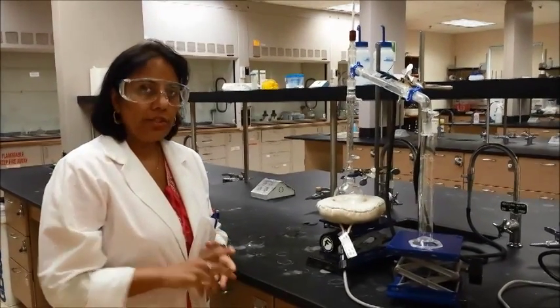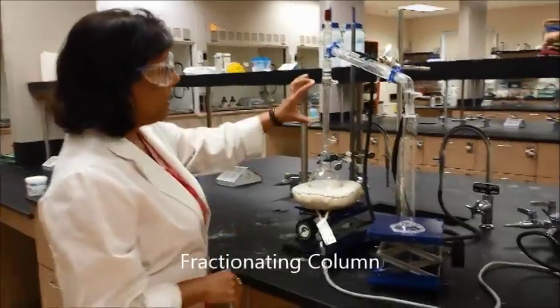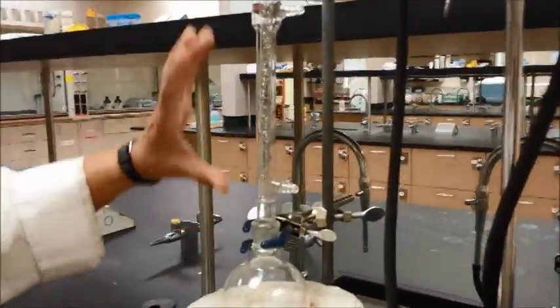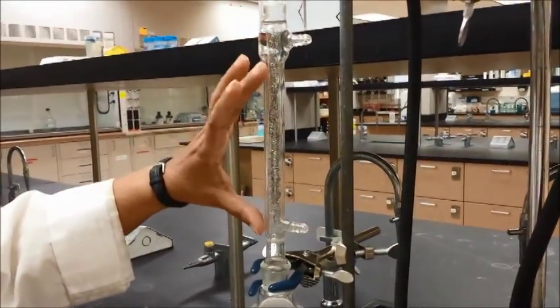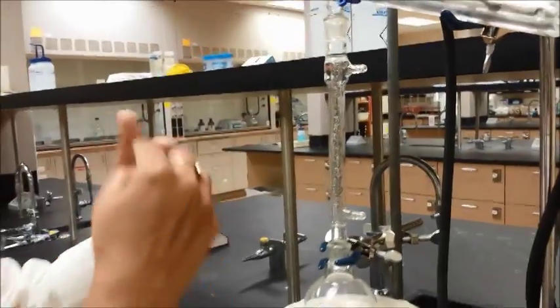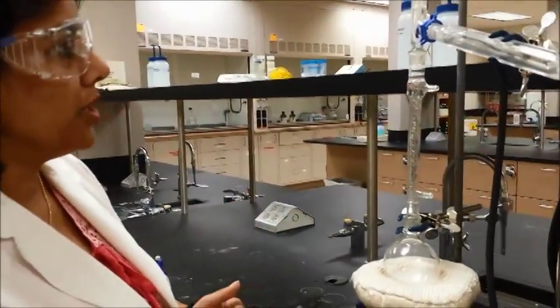To set up the fractional distillation you need to have a fractionating column. A fractionating column is one that actually has steel wool inside the column. It looks like a condenser but it has something inside, and what it does is provide a lot of little spaces for simple distillation to occur.